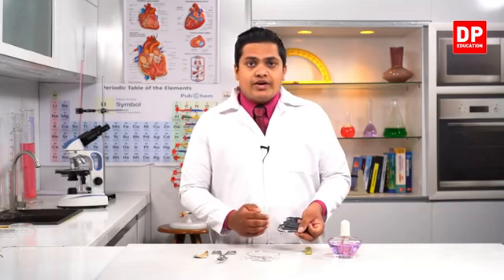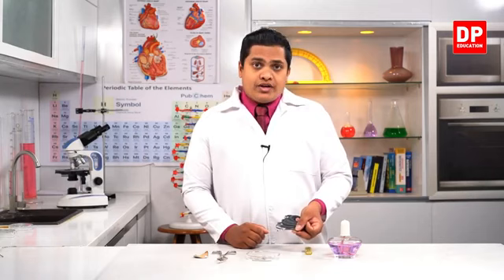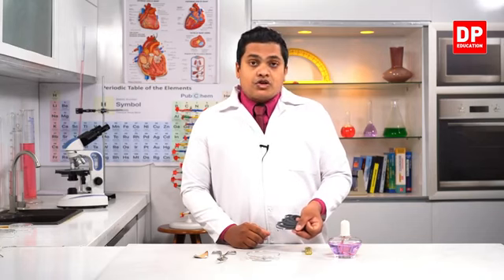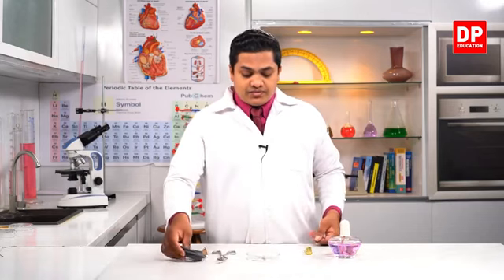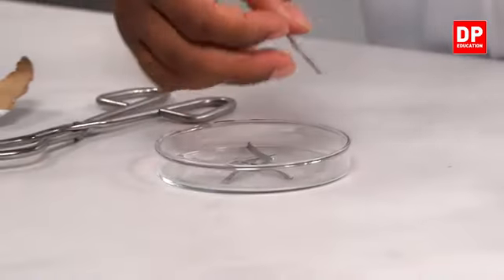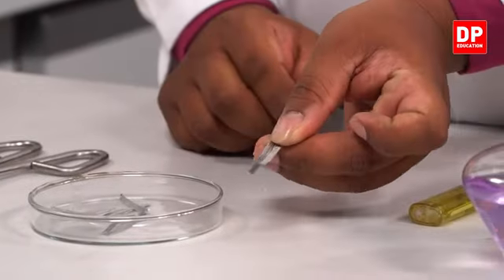Reactive means it's going to bond with oxygen quite fast. So when I keep this magnesium strip in our normal environment for 2 or 3 days, the luster of the magnesium will be reduced, and this ash-colored oxide layer can be observed.